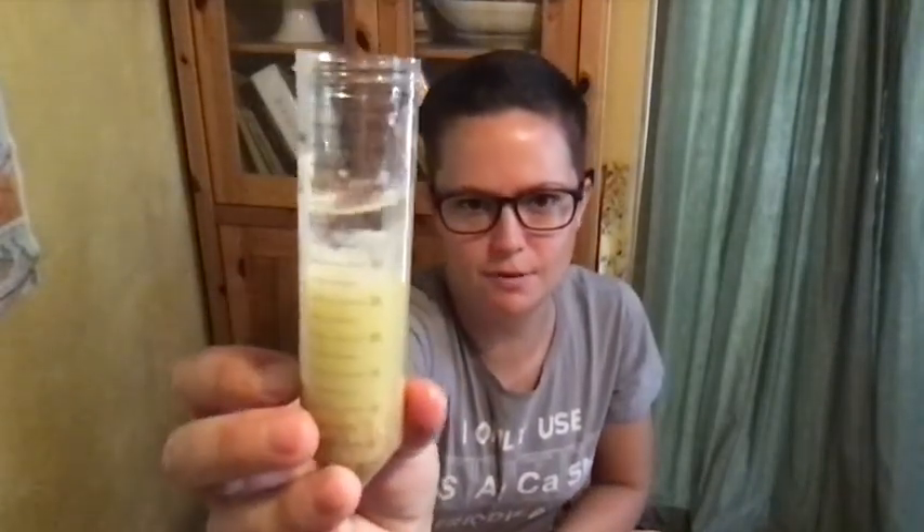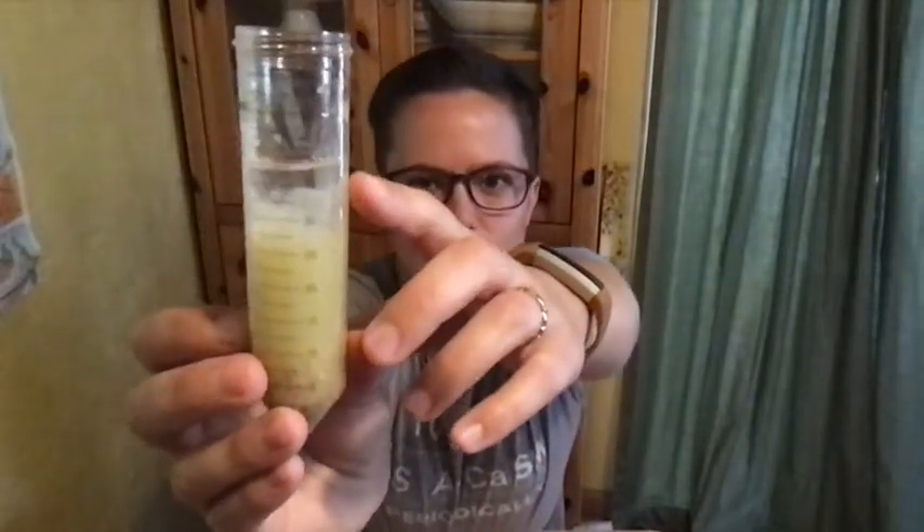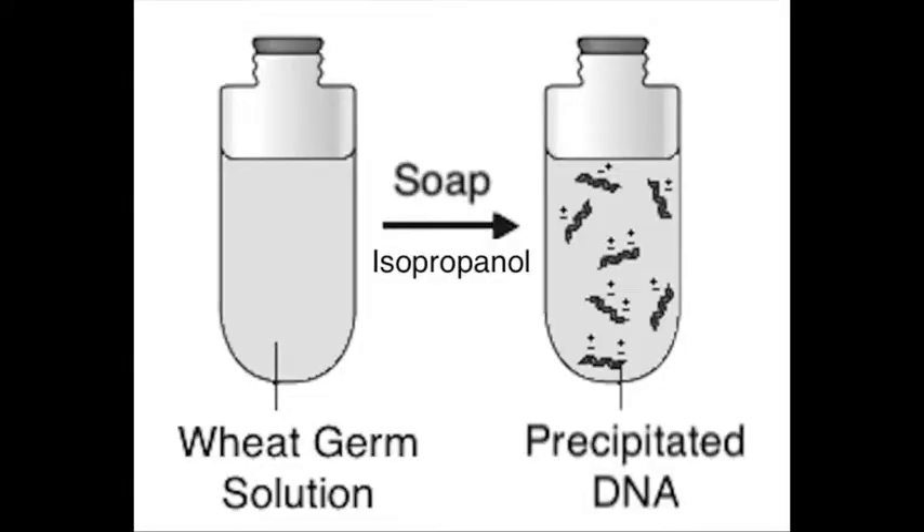You can see all that floating stuff in the top layer — that's your DNA. You've got your bottom layer that's junk, and your top layer of isopropanol with stuff starting to float up — that's your DNA. When you add the isopropanol on top of your soapy wheat germ layer, you are precipitating the DNA. To precipitate something means to make it more solid — so instead of the DNA being dissolved in solution, it becomes that stringy, gloopy stuff. That's what allows you to spool it out and separate it from all the cellular debris in your soap solution.